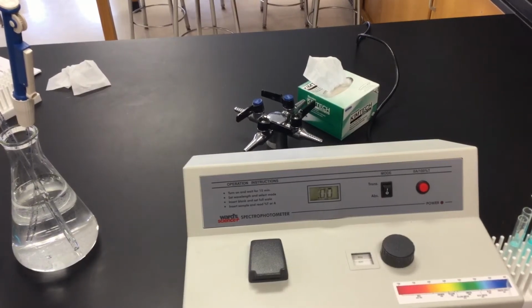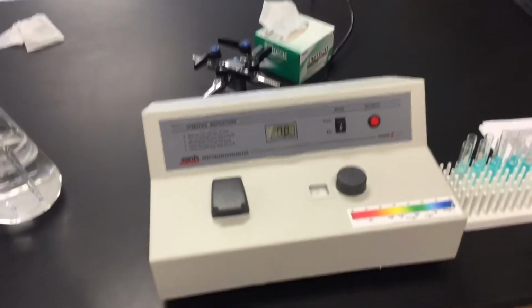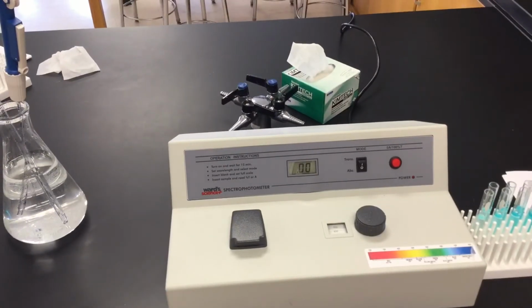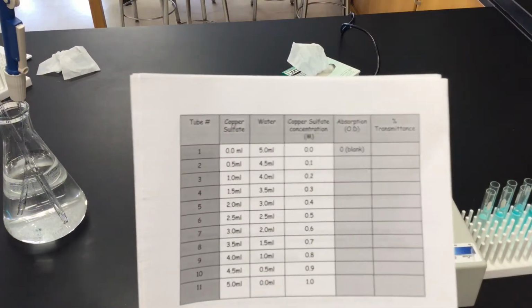And we're going to continue from where that just ended. So we have water in there, tube number 1 of our 11. We're at our maximum absorption of 620 nanometers. And now what we want to do is go through our chart. So we want to know, what is my absorption and what is my transmittance?